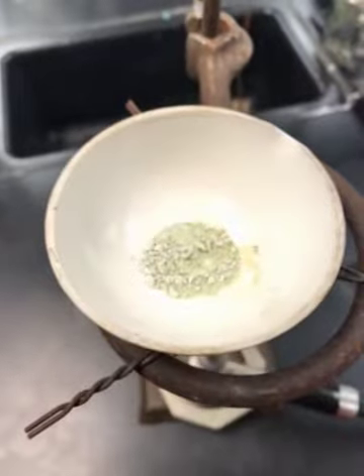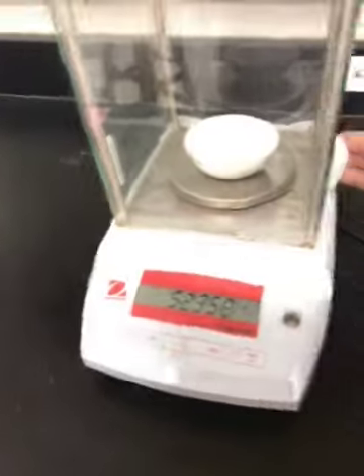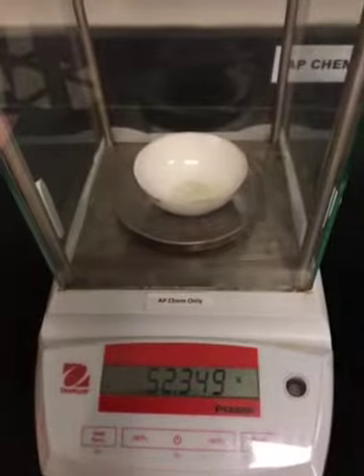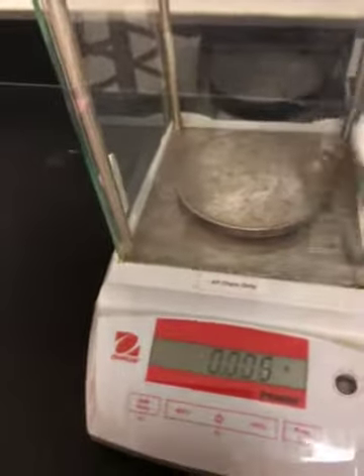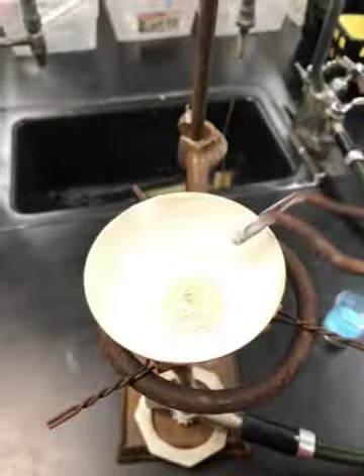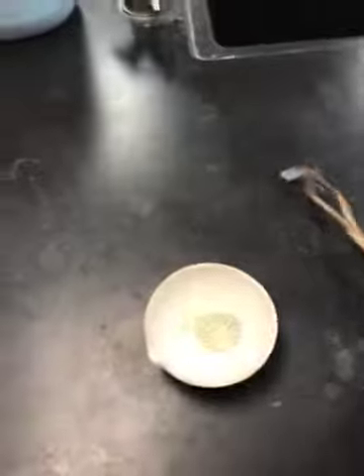So I've heated it a second time, let it cool, and I'm going to go ahead and mass it again. And if the masses are the same, then we're going to stop. If the masses are different, we're going to remass it. So it's a little bit different. So I'm going to go ahead and reheat it a third time, and then mass it for a third time. Okay, I've reheated it a third time. Check if it's cool enough to touch. Yep, it's good. So we'll go ahead and remass it.